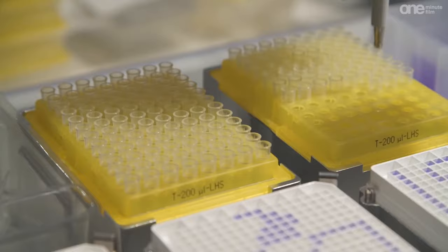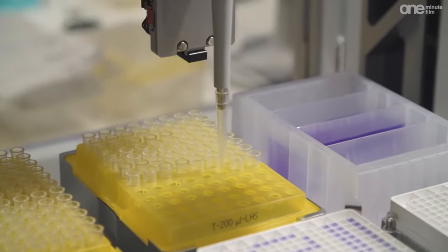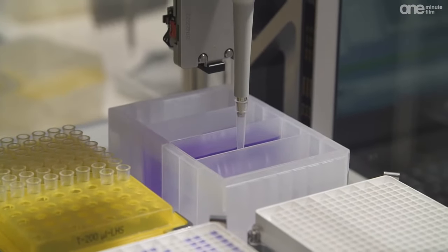The liquid handling station is often used in biological sciences and pharmaceutical applications that have small or medium-sized projects.